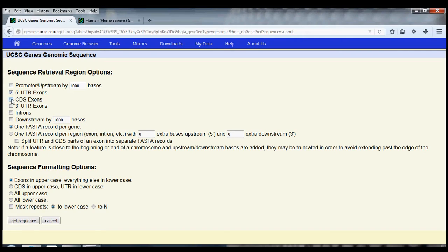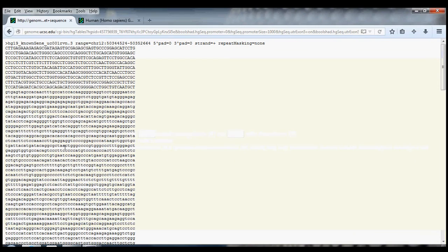So let's get the 5' UTR, the coding sequence, and the 3' UTR, and the introns in between. And finally, let's say that we want our exons of the gene in uppercase and everything else in lowercase.